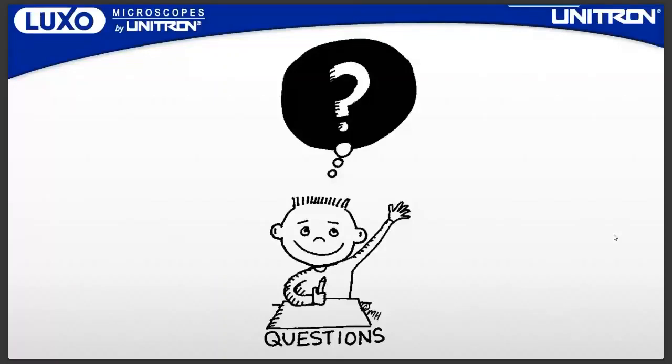Let's see what else we have. There's a question about base price and upgrade options. I think general pricing is something that's usually best left with your Unitron dealer.